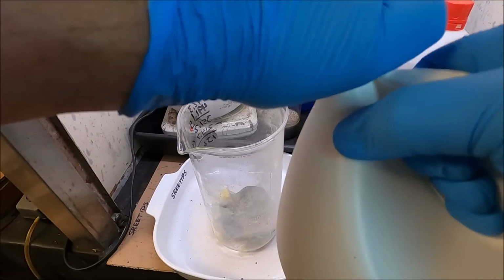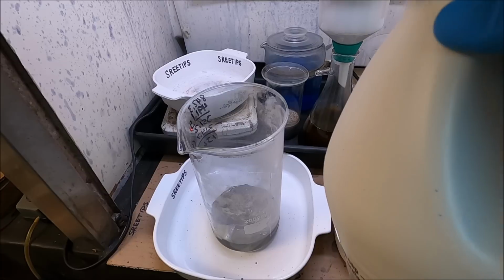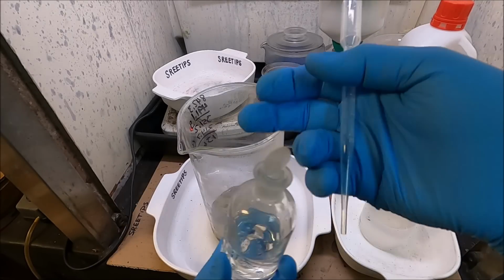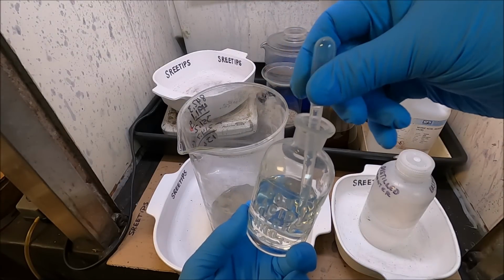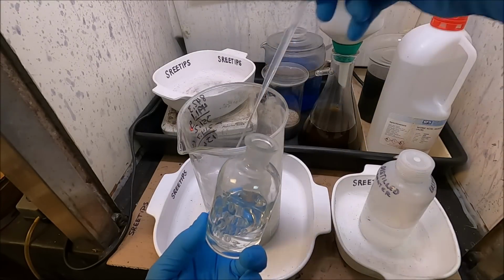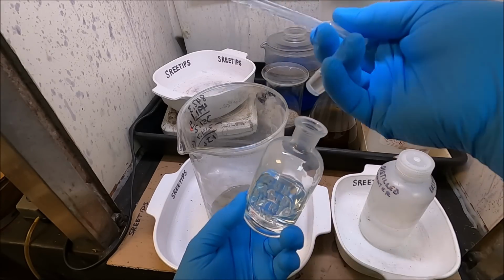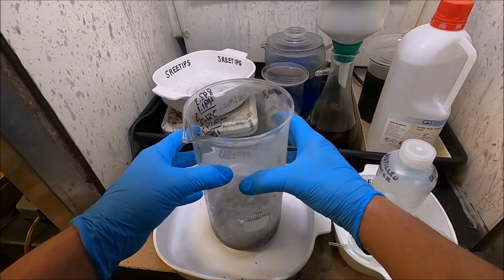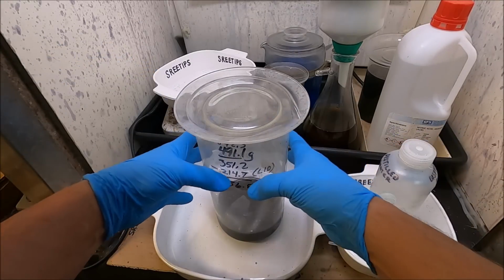Alright, I'm going to add about 250, 300 milliliters of hydrochloric. And then we're going to add small doses of nitric acid here and start a second extraction on these solids. See if we get any more out of there. That's 15 milliliters of concentrated nitric, 300 milliliters hydrochloric. Stir this up, start my heat, covered up, and up on the heat it goes.